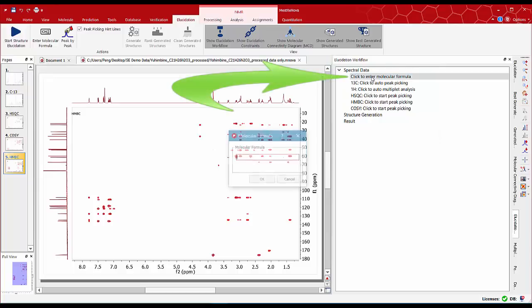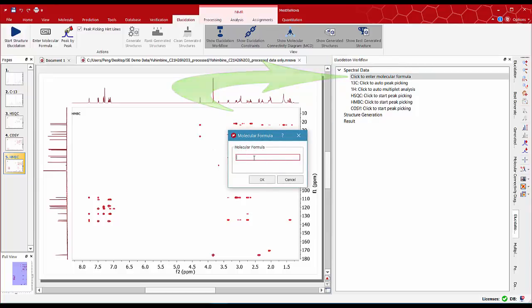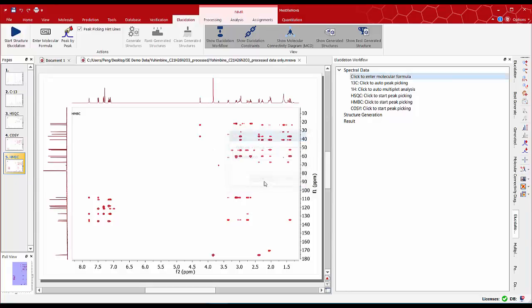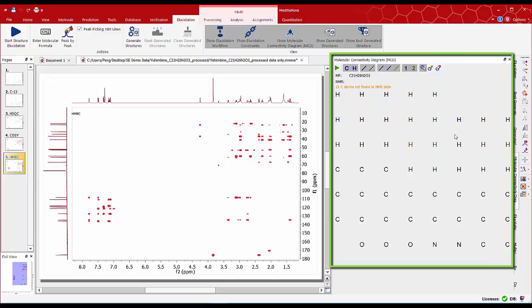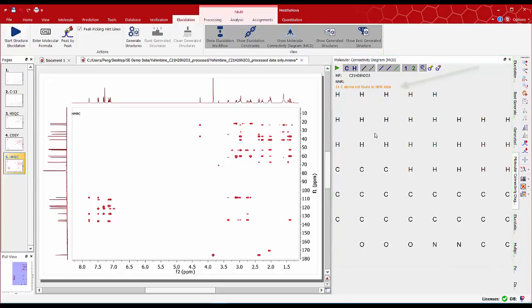Use the click to enter the molecular formula button and type the molecular formula C21H26N2O3. All the individual atoms are displayed on the molecular connectivity diagram the MCD. A starting point with the warning message in orange: 21 carbon atoms not found in NMR data.